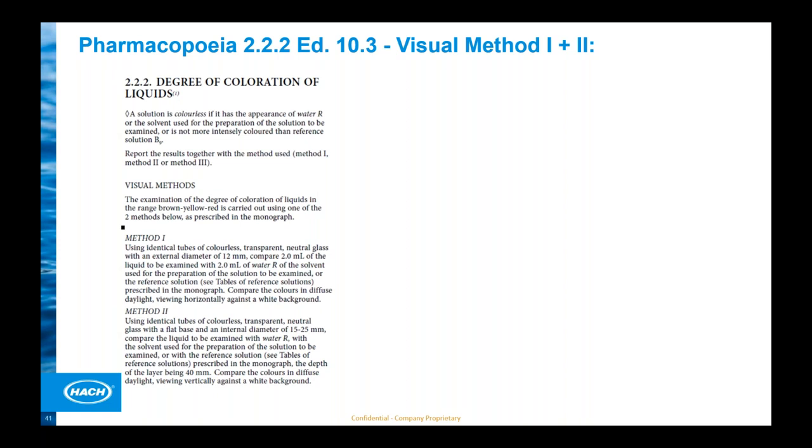Do I have a high quality product? Then probably my delta E definition is very small, or my tolerance is small. And do I have just a consumer product? Well, probably my delta E tolerance is much bigger.